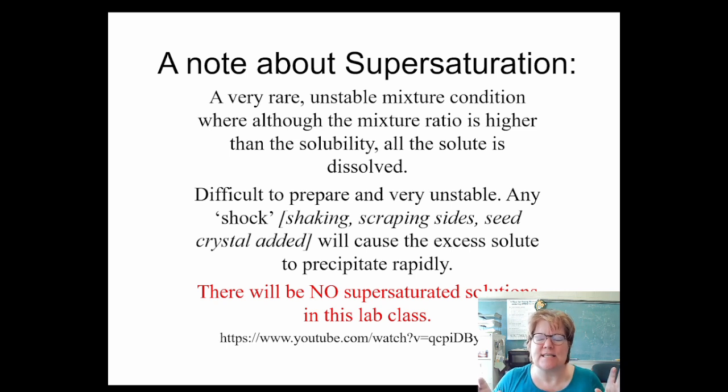The idea is that the slightest change, because it's so unstable, you shake it, you scratch it, you bump it, you stir it, and all of a sudden all that extra beyond the maximum can't stay dissolved, it really shouldn't have been dissolved, and it all precipitates, turns solid and falls down very quickly. It looks pretty cool. But there'll be none of that in this lab.